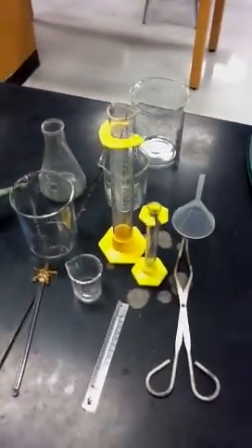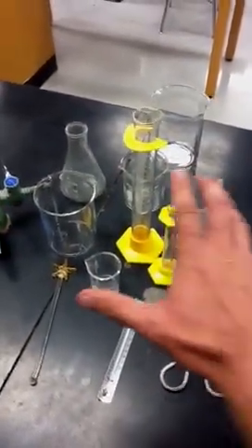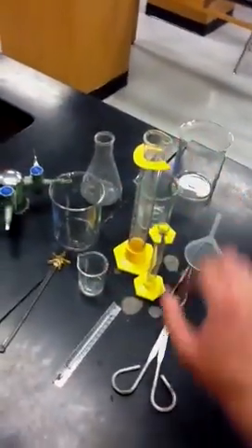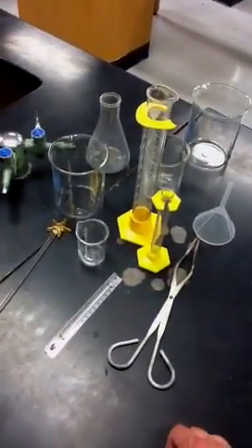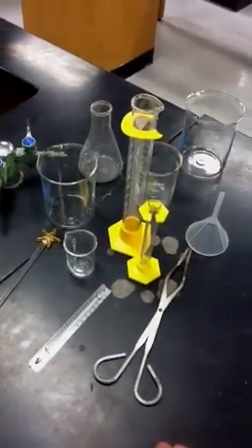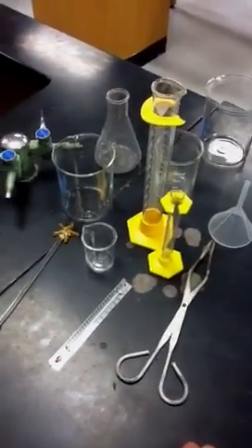Also, this will be one of your competitions that you've got to know, so it's important to pay attention to what I've got here, what the names are, and how they're used. I kind of got them grouped by classification and what they do, so we'll start with this big group right here. These are all used for measuring things.